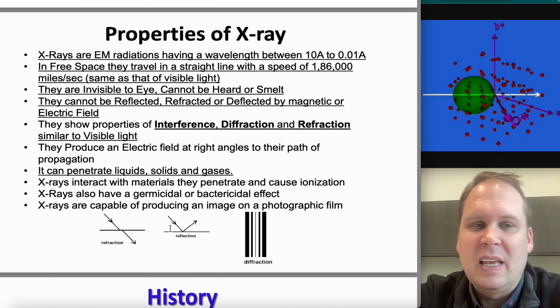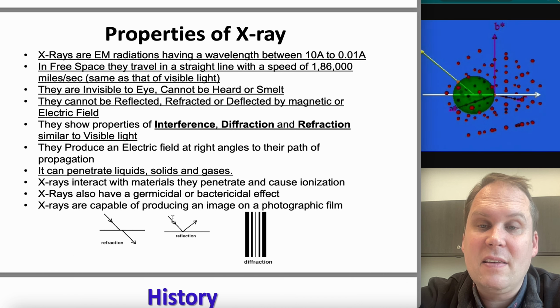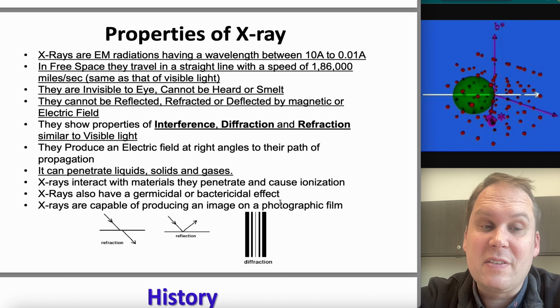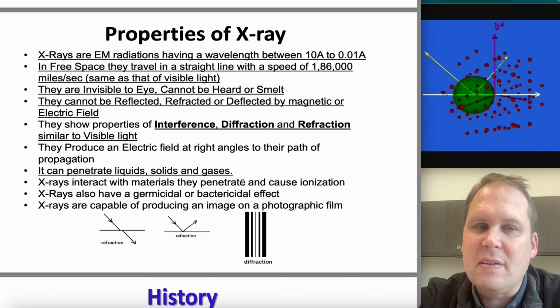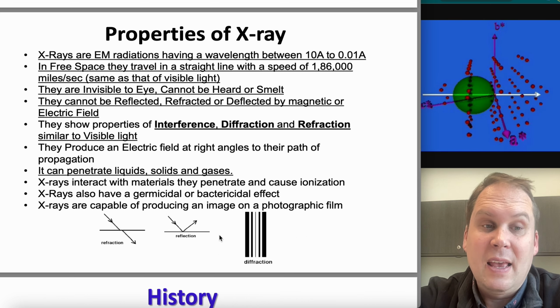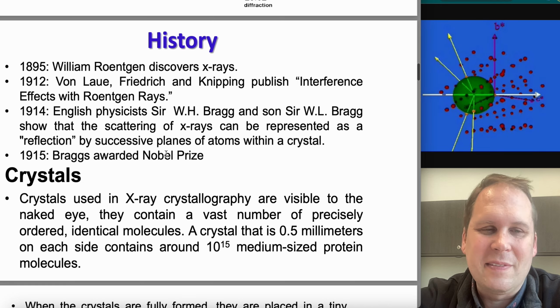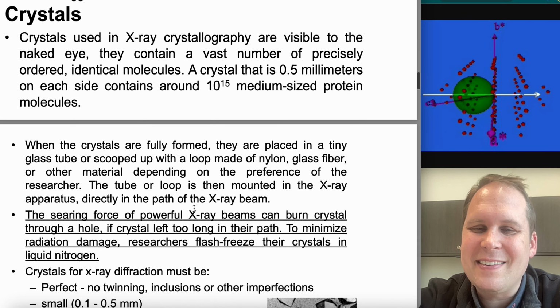Okay. So X-rays can pass through, which is refraction. X-rays can be deflected, which is reflection. Rather, it can sort of bounce off. Or X-rays can diffract, which is this crazy wave property. And it's this diffraction pattern that essentially we're producing and that we're going to rely on. And X-rays pretty much don't care. They'll go through anything, or most anything. So it was invented by various people. They got various Nobel Prizes.